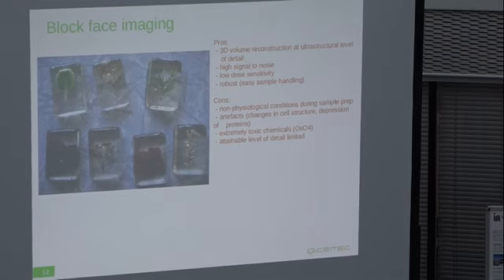So in the next phase, I would like to touch on the method that allows you to reconstruct a 3D volume of your specimen. So we can work with larger volumes, and this primarily comprises embedding of your specimen into resin, followed by slicing and imaging in TEM. This can be done for very large, macroscopic samples, but it can also be performed for cell suspensions in order to learn about the structure of the cell at the ultrastructural level.